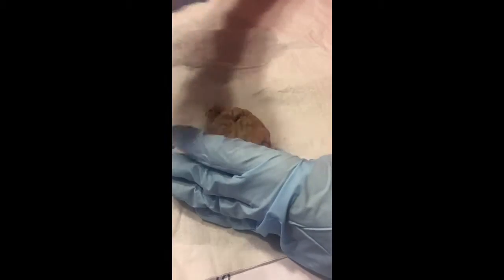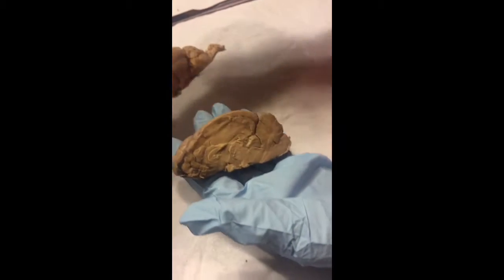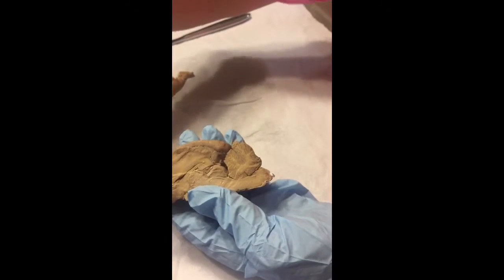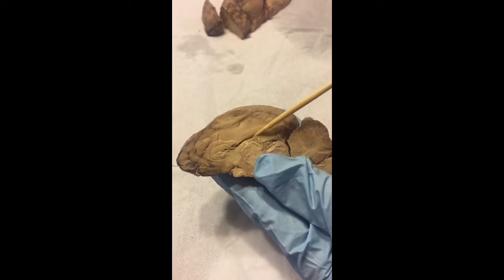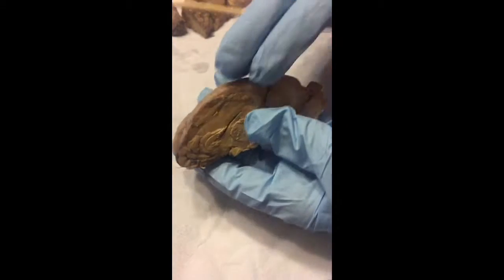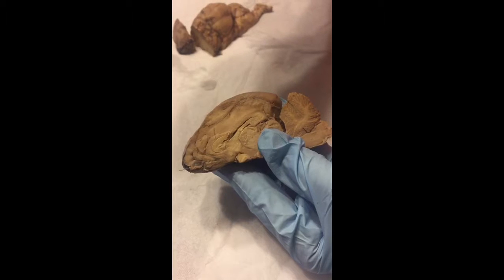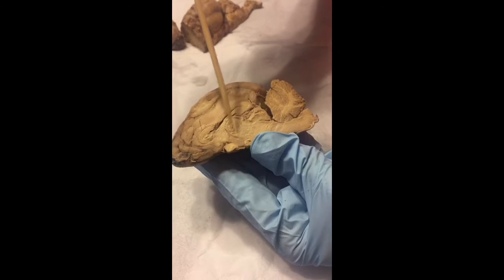Okay, next we're going to do the internal anatomy, which here's another cross section. We have the corpus callosum, which would be this line right here. Next, we have the lateral ventricle, which would be this part right here. Next, we have the thalamus. The thalamus will be this part right here.